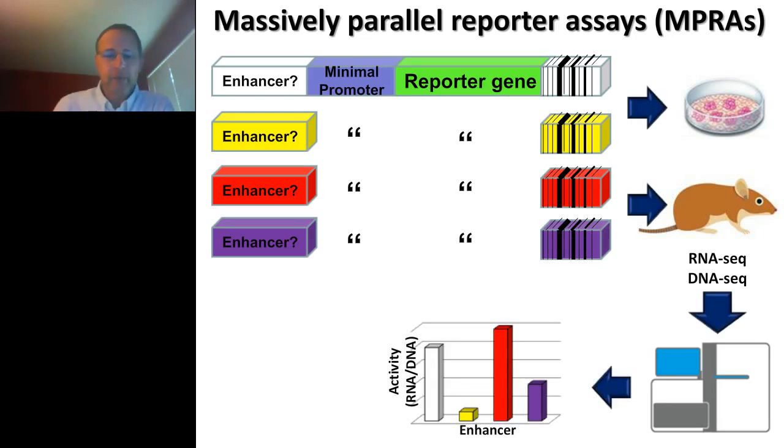And so the readout could look something like this, where, for example, if we look at this red enhancer, we got DNA into the cell, so we know this went in.